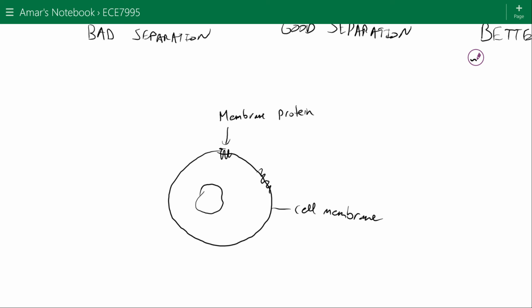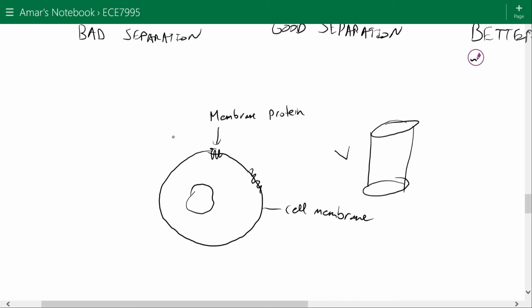And you can create antibodies. You can create these surfaces, or pillar-like structures that present these antibody groups, and these antibody groups will capture the cells as they pass by those surfaces. So imagine having an array of these pillars, and the cell is being pushed through that pillar array. Eventually, the cell will bump into one of those pillars, and it will be captured by these antibodies that have been functionalized on the wall.